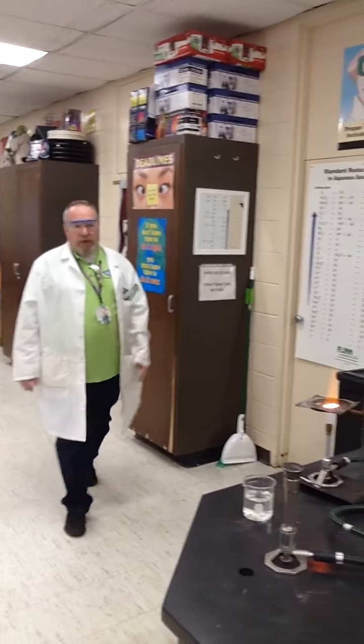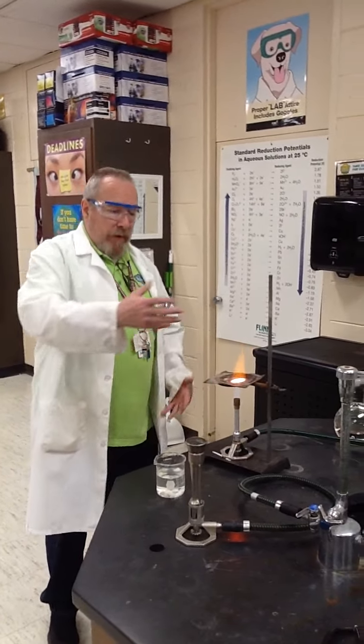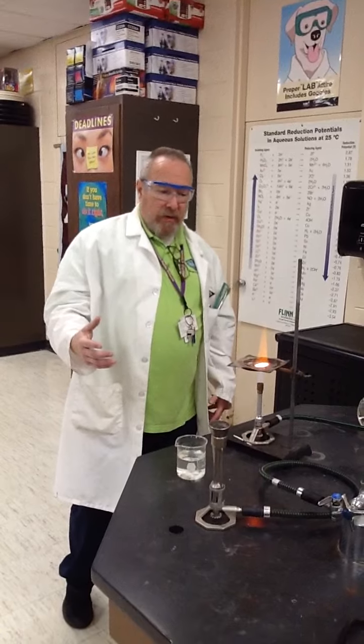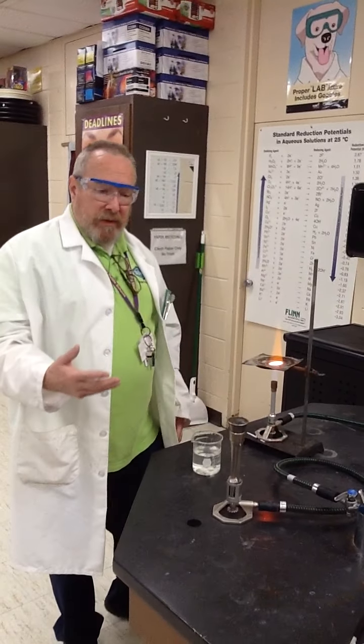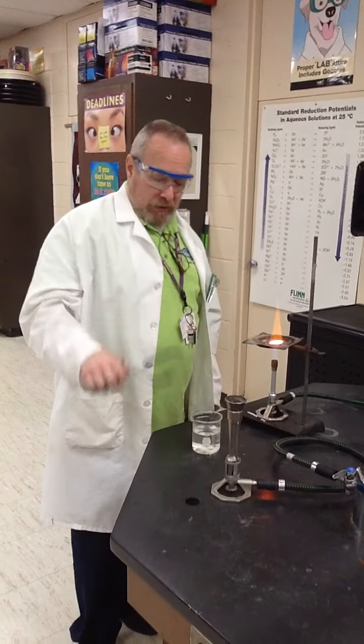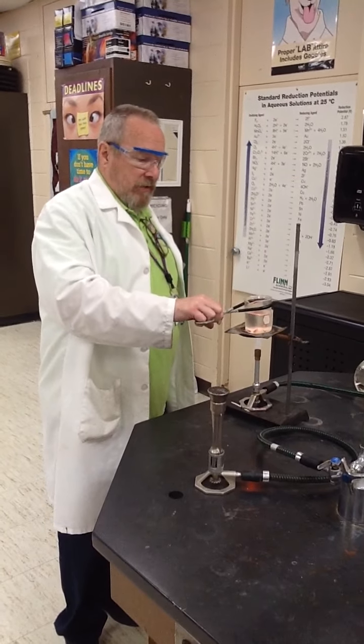Now, this is very hot, and if I put my beaker on there, I'm exposing myself. My hair's tied back, of course, if I had long hair. I'm exposing myself to fire and flame, so I'm going to use beaker tongs. And I'm going to pick up my beaker with the beaker tongs and set it on top.